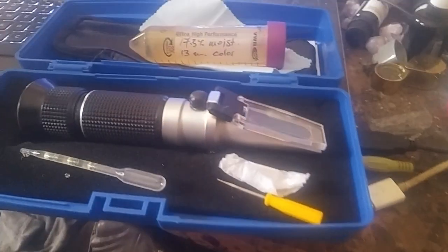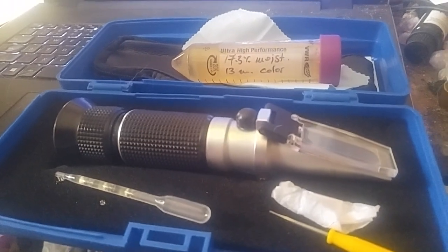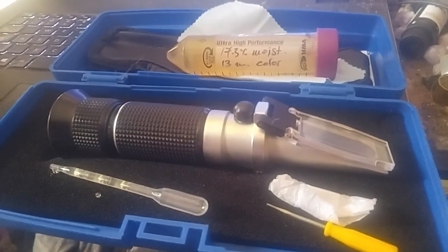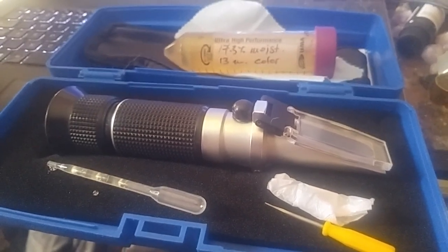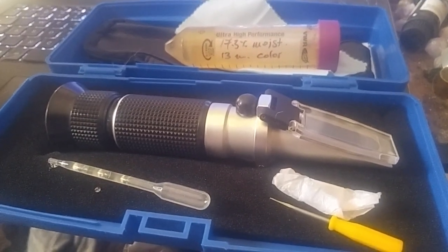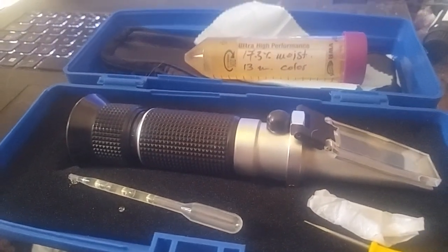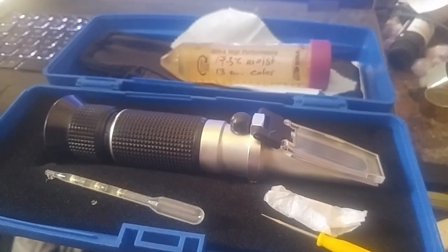Back to this — if you're going to sell honey, you've got to have one of these. You've got to test your honey. Each box that I take off to extract the honey will be tested as it's taken off, and after it's processed will be tested again. So there'll be no funny honey — I want the real stuff.